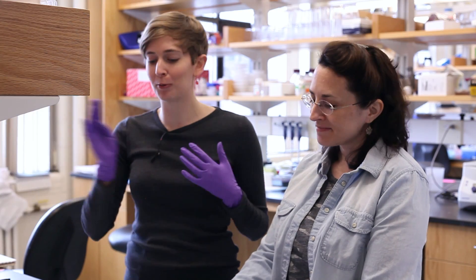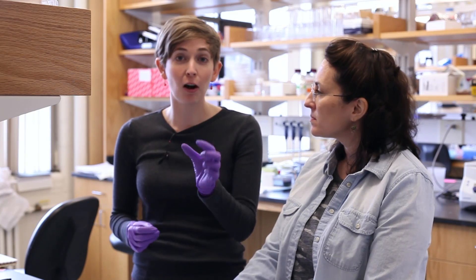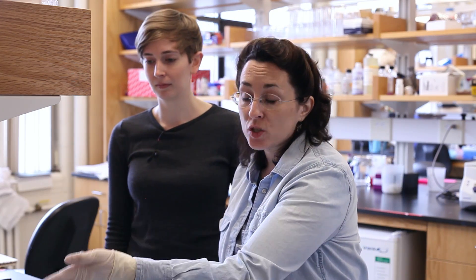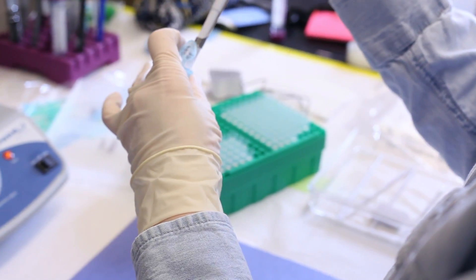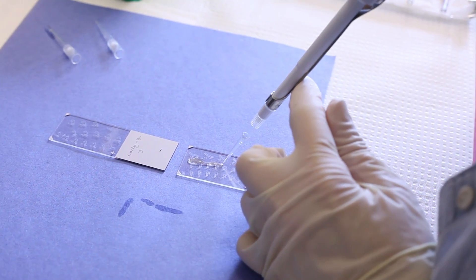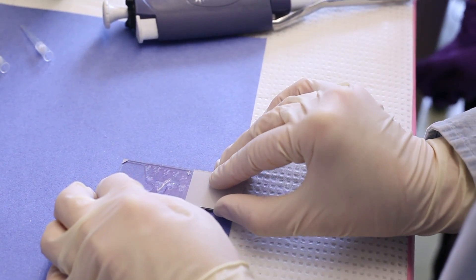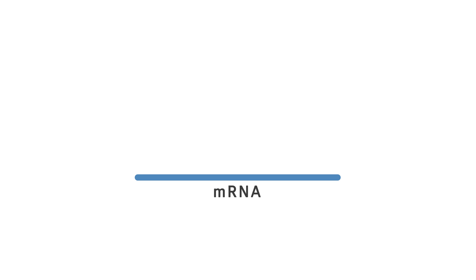Now that the slides have been through those solutions, they're ready to reveal where they're expressing histone H4. We've designed a little piece of RNA called a probe that is able to interact with the tissue's copy of histone H4. We have the probe in one tube, and I'm going to mix it with a solution called the hybridization solution — the magical solution that helps the probe interact with the RNA in the tissue. I'll spread that mix on the slides, then sandwich two slides together so the sections face each other, creating a tiny space where hybridization actually occurs. Now you know why this experiment is called in-situ hybridization: the probe hybridizes to the plant's own RNA in-situ, in the original place where the gene is expressed. It has to incubate overnight so the hybridization works well.